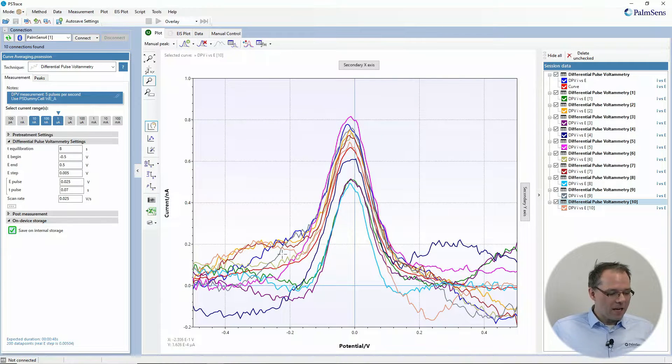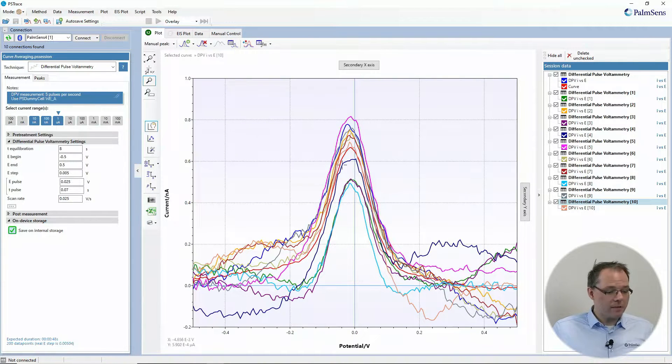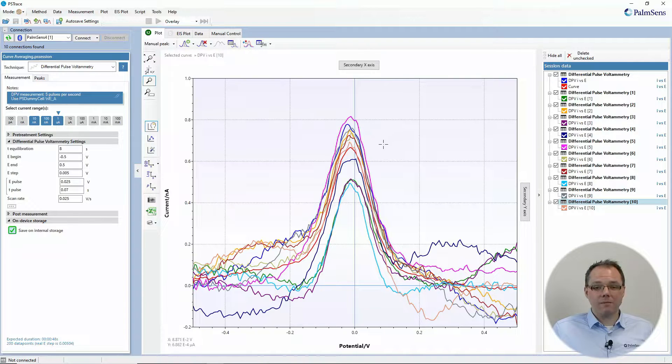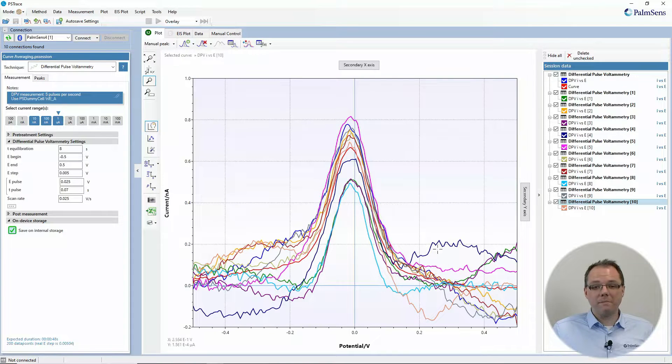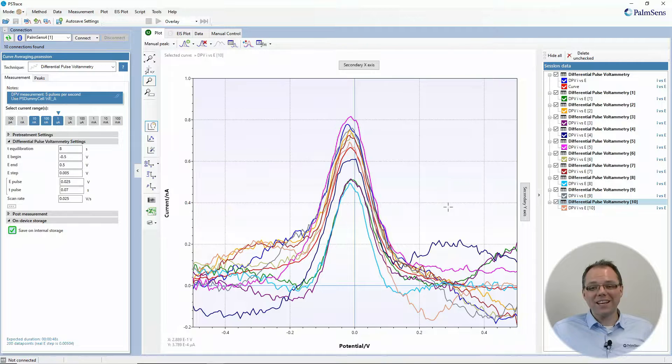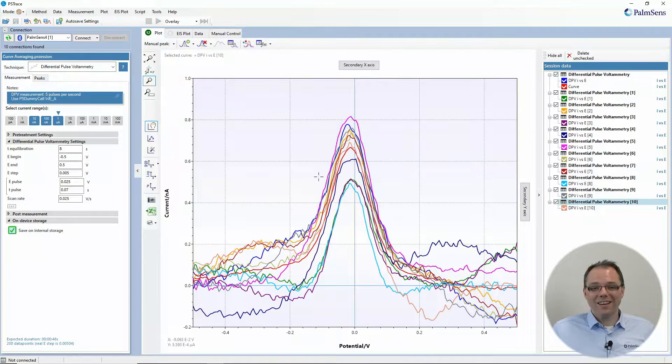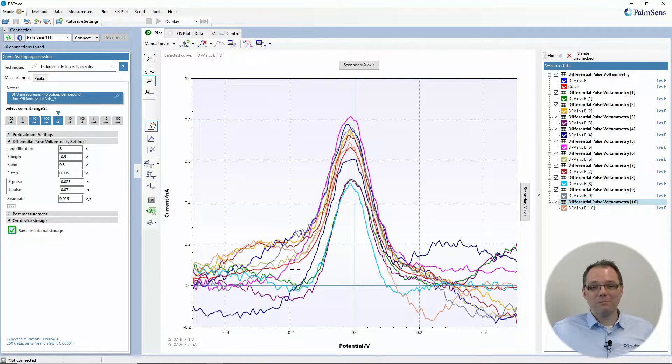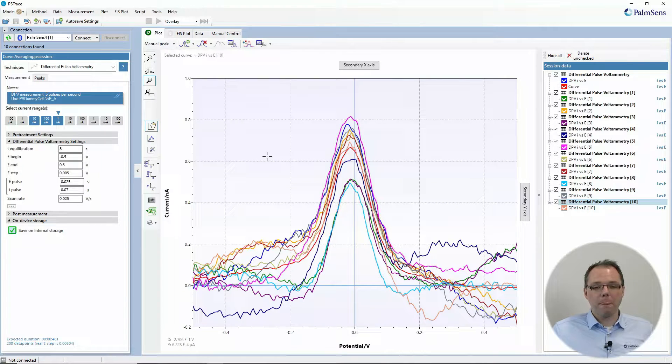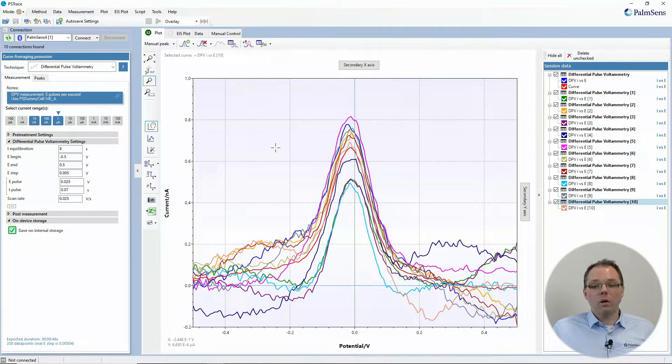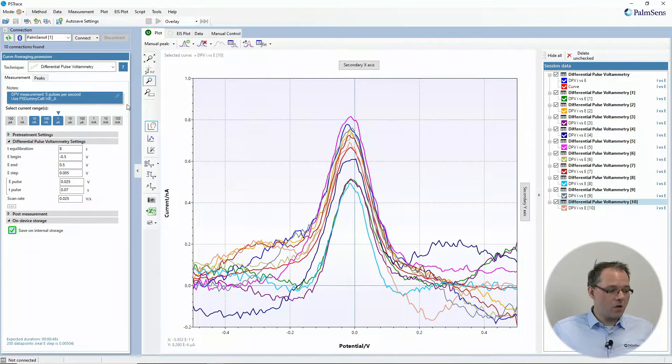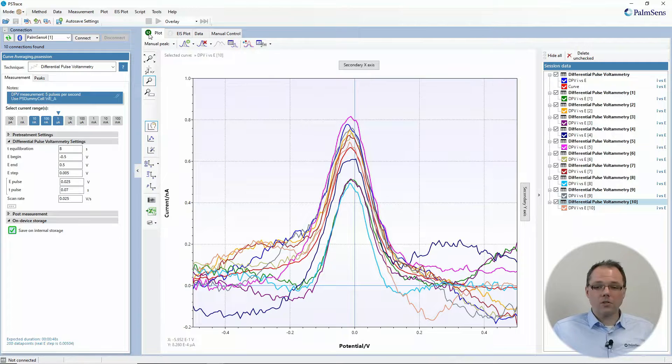So here you see multiple measurements that I have done in a noisy environment. So actually this is all the same measurement, but I had it open without a Faraday cage next to a computer. So there was some noise distorting my DPVs that I did here. Well, one way of getting rid of noise could be averaging of these curves and that you can do in PS Trace.